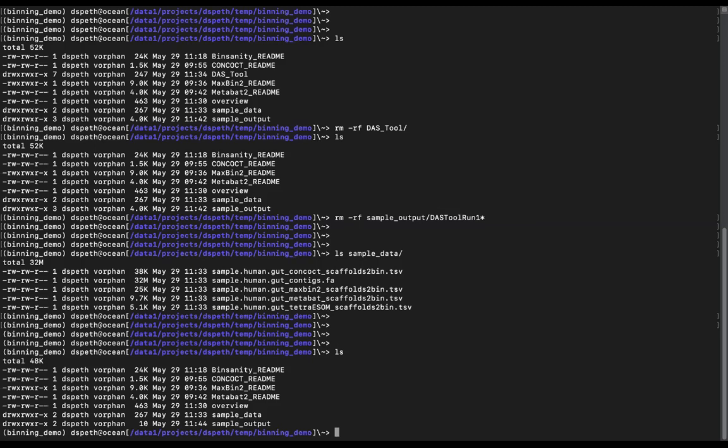This scenario could happen if you've looked in your metagenome and found that there is a specific gene that you're interested in, and it is divergent from the ones that you know, and you're curious what organism it's in. In that case, you could run the whole binning pipeline and get all the organisms, or you could specifically say, okay, let me just go and identify that one. That topic we'll not cover today.